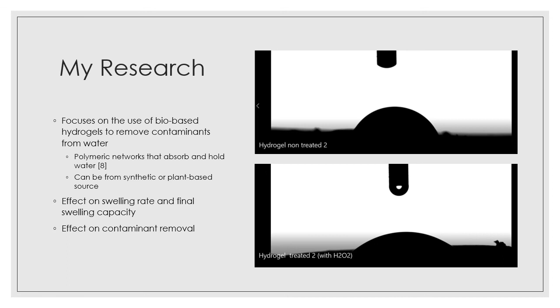I will also be testing to see if the surface modification affects the ability of the hydrogels to remove contaminants from wastewater. On the right, you can see pictures from my actual research, and you see that the coating increases the hydrophilicity of the hydrogel.